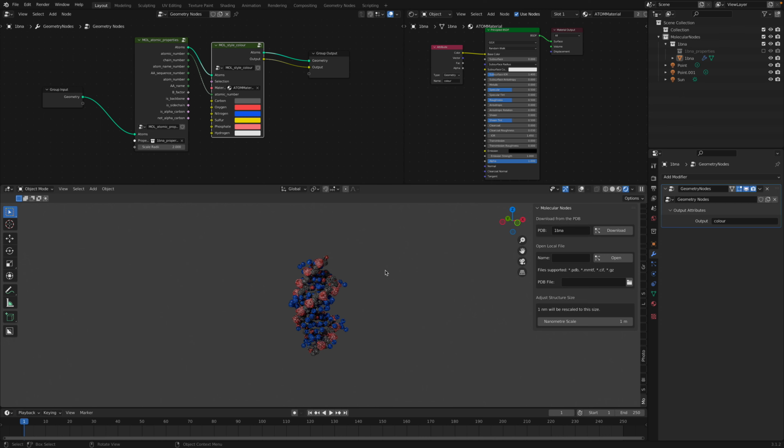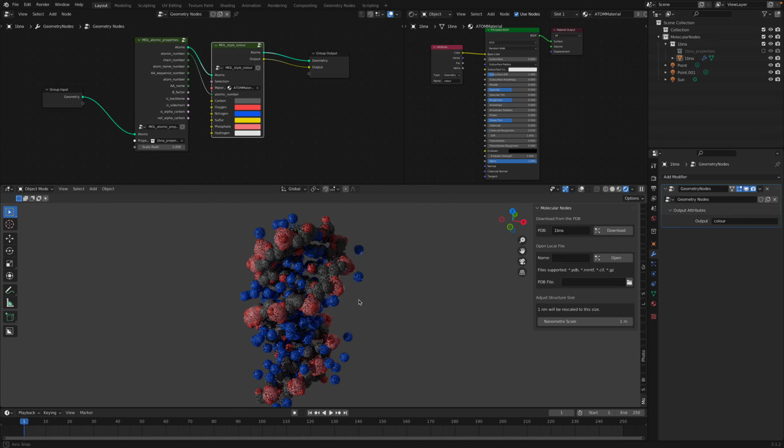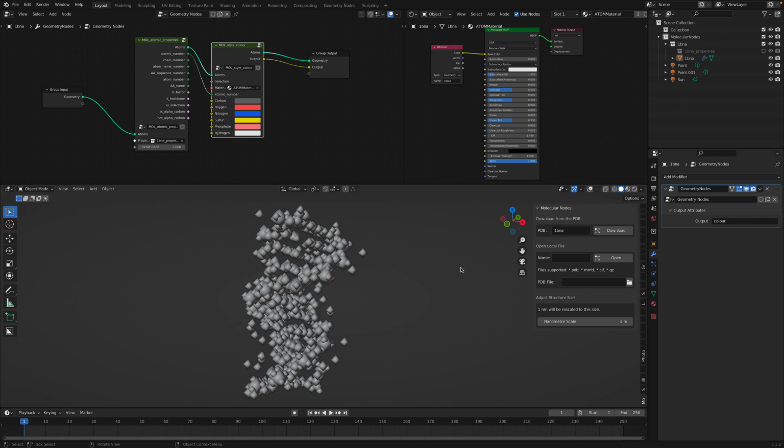This is how it gets visualized using Blender Cycles render. It's still okay, it's indeed looking like DNA. Maybe there's a few things like the connections that could be visualized better, but currently it's just a bunch of points. It might be that the add-on is still a work in progress, but still interesting.